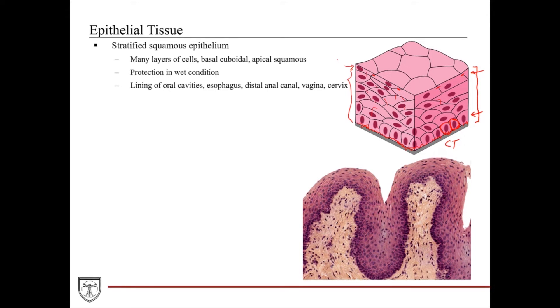Here's the histology of stratified squamous epithelium. Here's the connective tissue and epithelial tissue boundary where the basement membrane would be. We can see that the epithelial tissue has the basal compartment with more cuboidal cells. Interestingly, the cells in the basal compartment seem to be smaller because these are not only the cells that express hemidesmosomes, but there are a lot of stem cells there as well that are dividing to replace the cells shedding from the apical surface. As we move towards the apical surface, we see the flattening of the cells and their nuclei, and even on the apical surface the cells are super flat but still retain their nuclei, suggesting they are still alive. So that's stratified squamous non-keratinized epithelium.